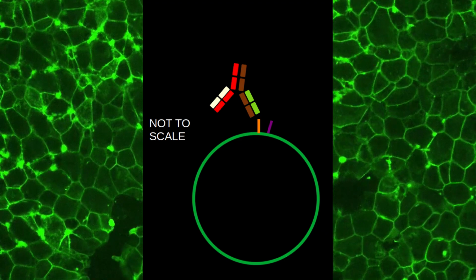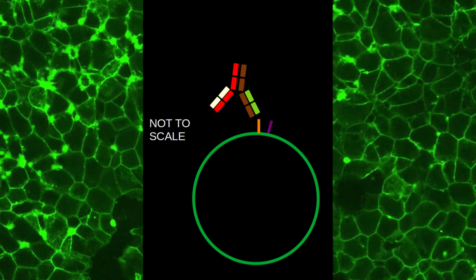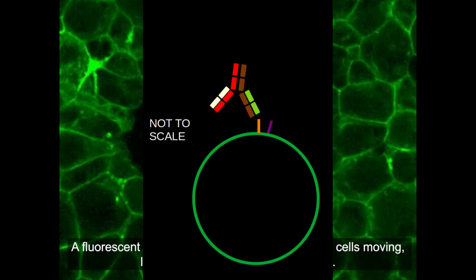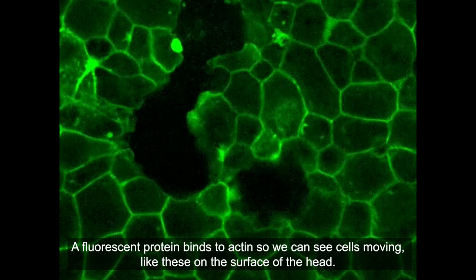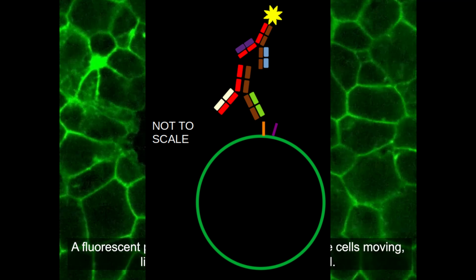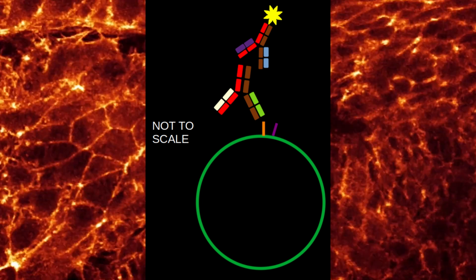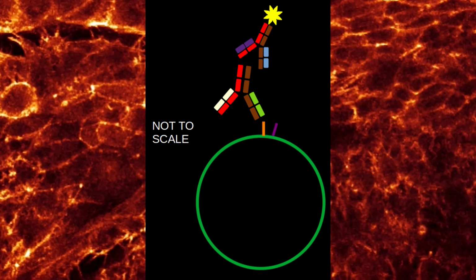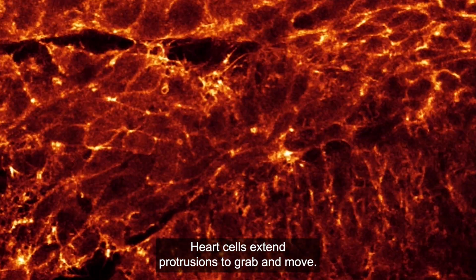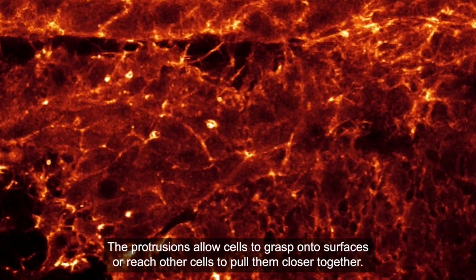antibody. In many cases, this doesn't always work, and in some cases it's undesirable to have a primary antibody only. And this is particularly true if you're looking at something where you want to differentiate two very closely related things. This is where you may use a primary antibody and then a secondary antibody. The primary antibody doesn't have anything attached to it, but it's reactive to the secondary antibody that does have the fluorophore attached. A simple example would be, say, anti-whatever your target site is as the primary antibody, followed by a secondary anti or whatever it is that you've derived your first antibody from.